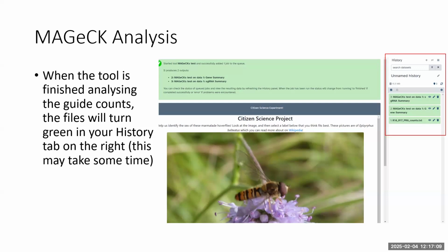And that takes the really big computing power. That takes the longest time because it has to take each guide and try to match it to any of the other open reading frames. That's the one they'll do on Eddie Roslin, to have the compute power to do that. All that is beyond me. This is mainly beyond me, but that's really beyond me. Yeah, that's where we get Nick to help design the guides.